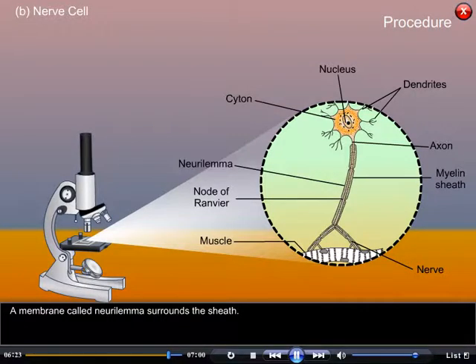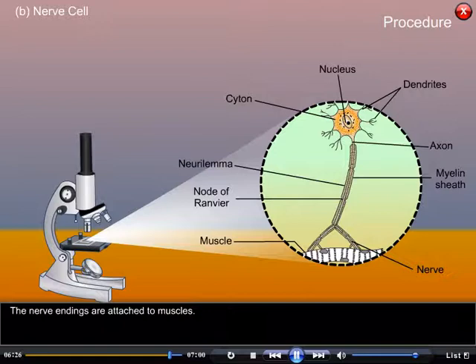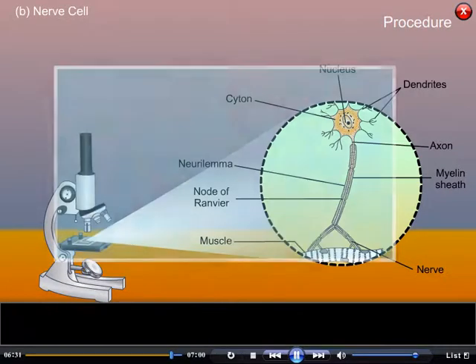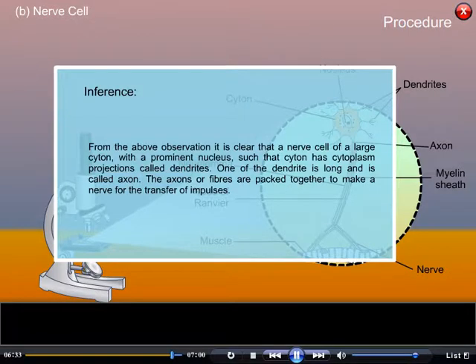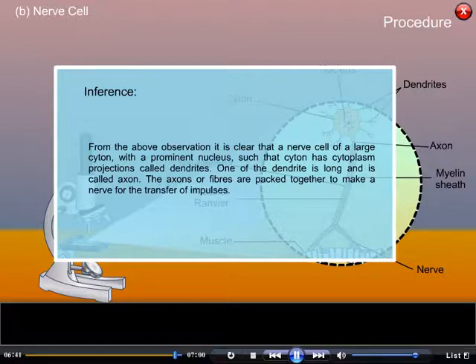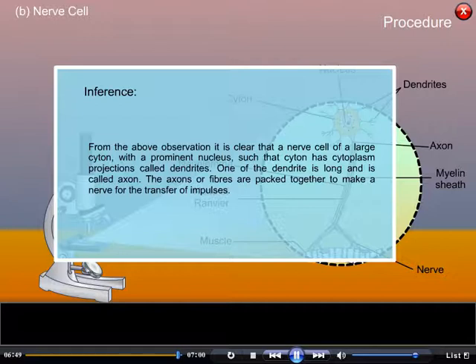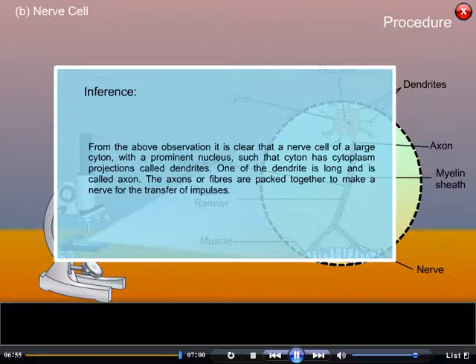A membrane called neurolemma surrounds the sheath, and the nerve endings are attached to muscles. Inference: From the above observation, it is clear that a nerve cell has a large cytone with a prominent nucleus. The cytone has cytoplasmic projections called dendrites, one of which is long and called the axon. The axons or fibers are packed together to form a nerve for the transfer of impulses.